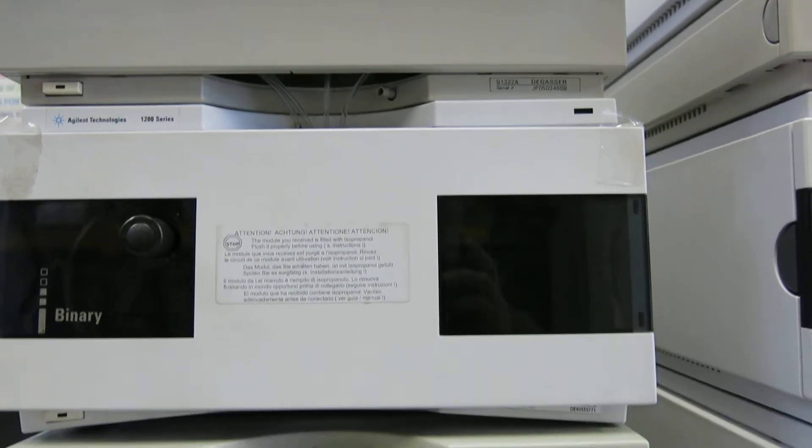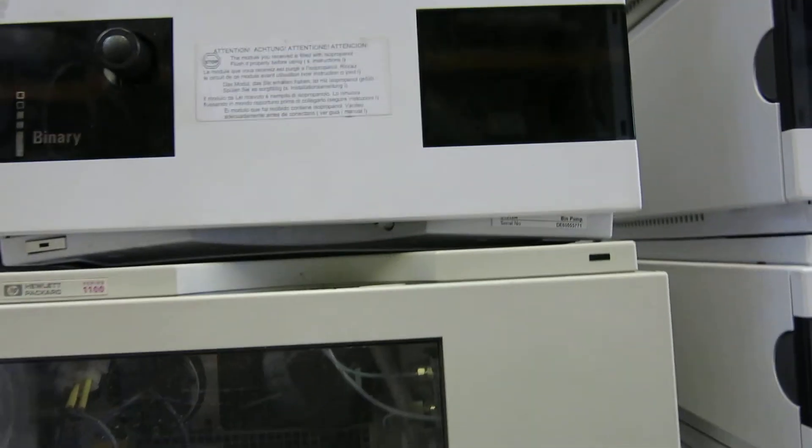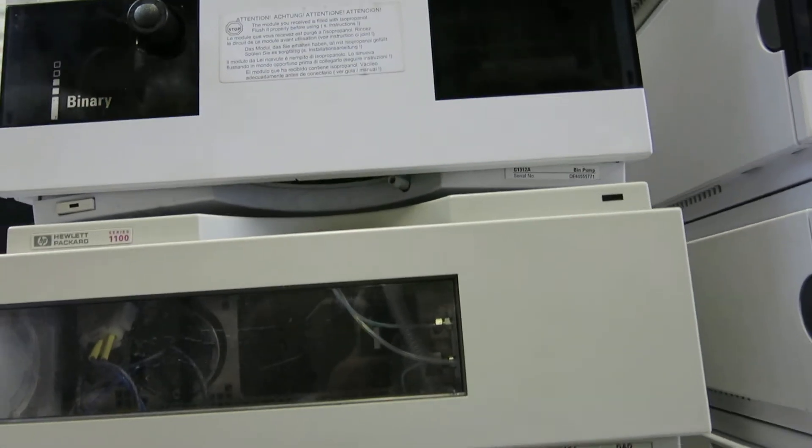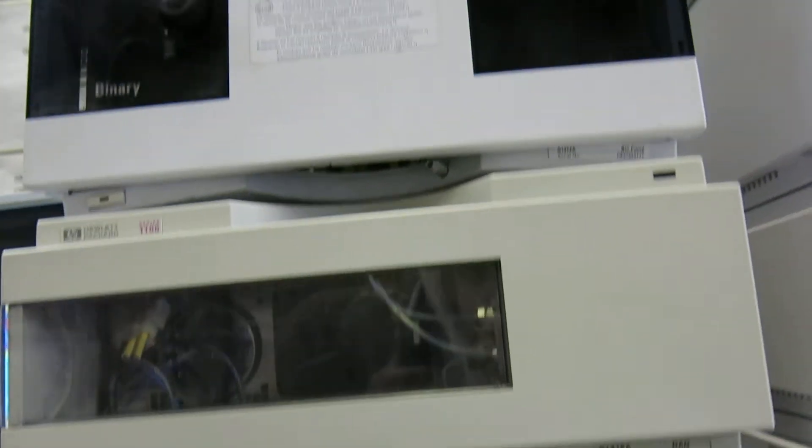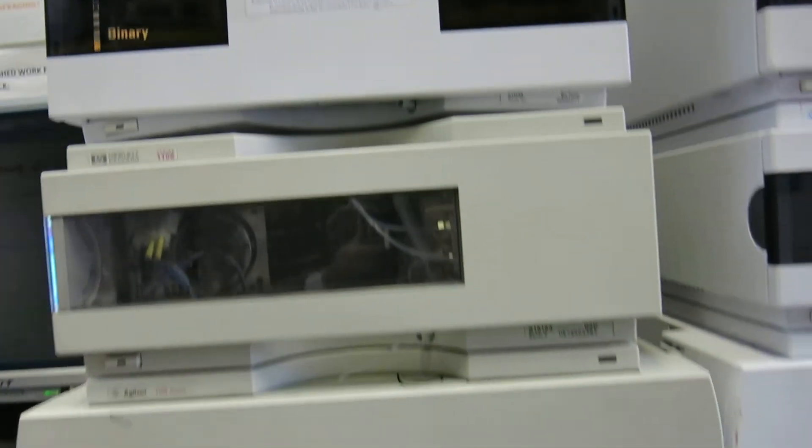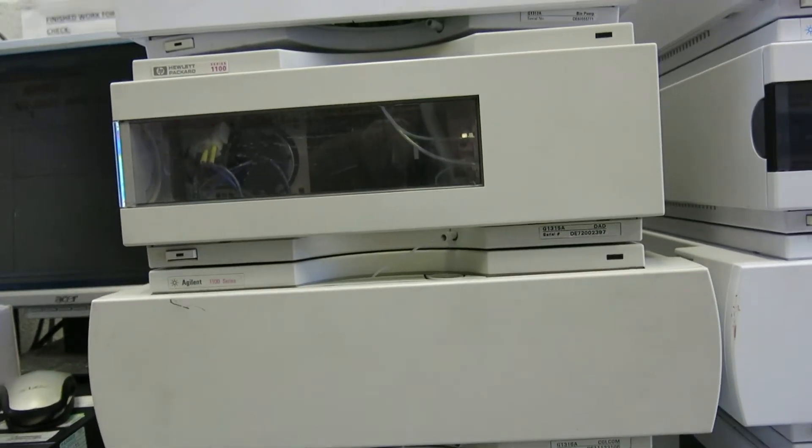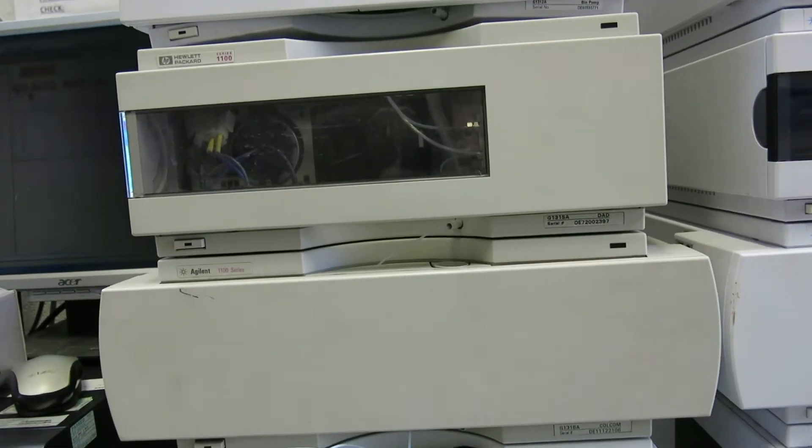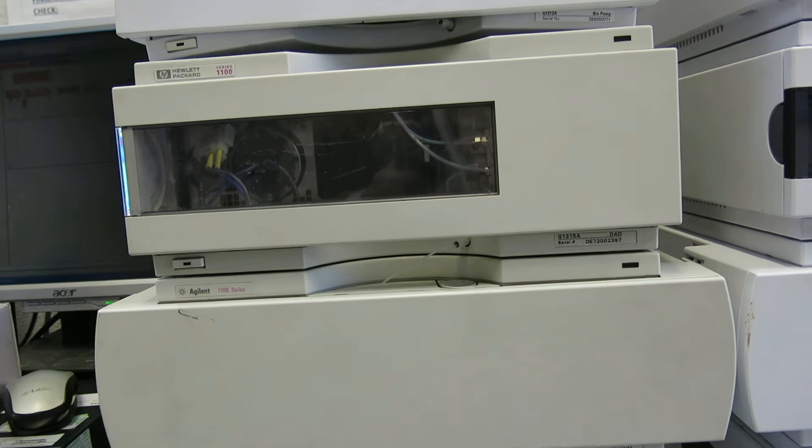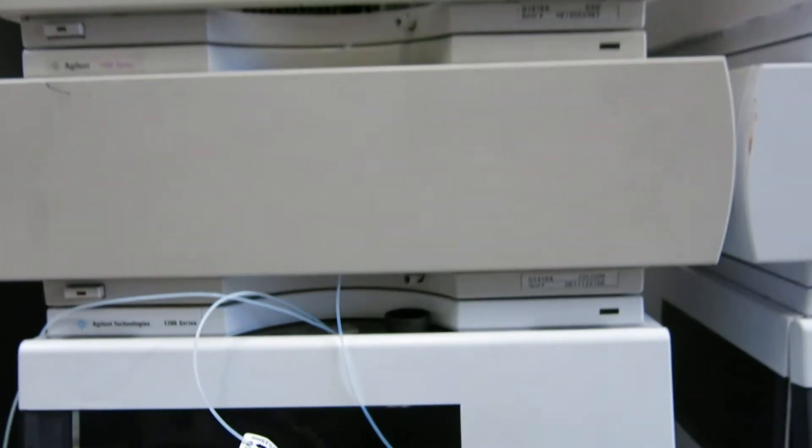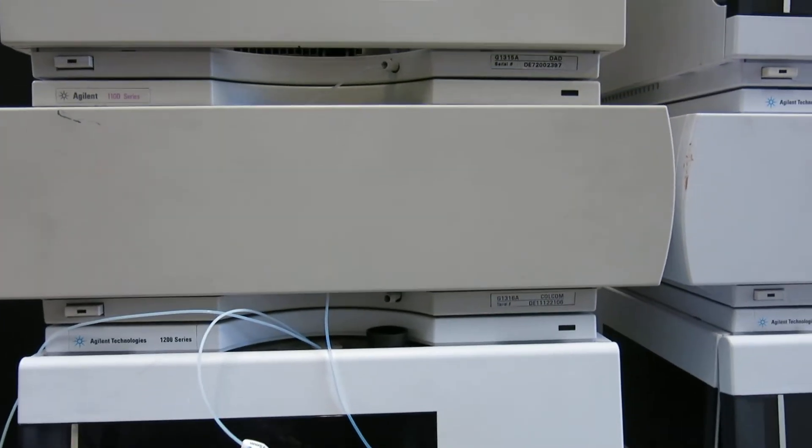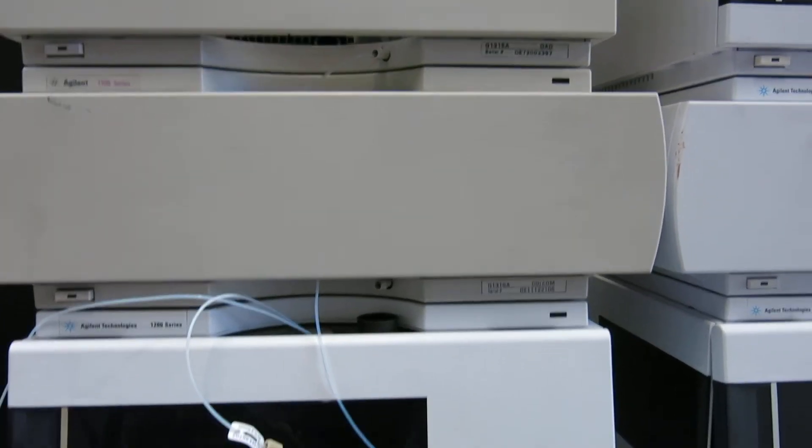The degasser we've done. We've now got a binary pump which is a G1312A. We've got a diode array detector which is a G1315A. We've then got the column compartment which is a G1316A.